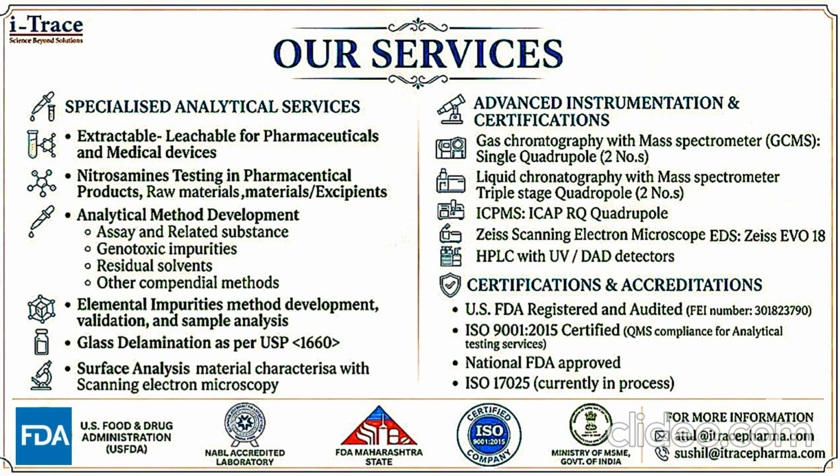Glass delamination has triggered some of the most expensive and reputation-damaging recalls in the pharmaceutical industry over the last decade, and in almost every case, the risk was predictable long before it became a crisis. Over the next few minutes, we are going to walk through exactly how to predict it, detect it, and prevent it, using the framework laid out in USP General Chapter 1660.